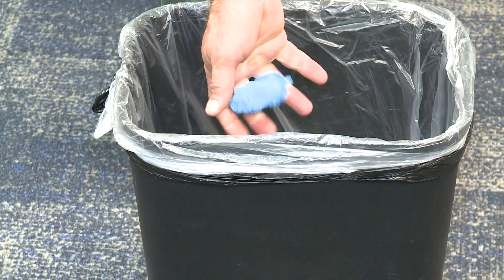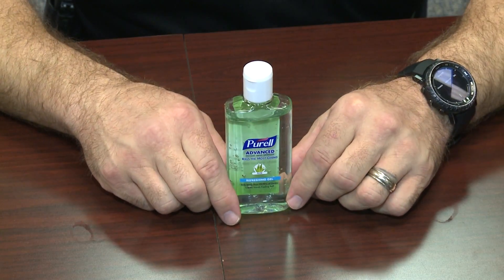Place gloves into the appropriate waste container. Always remember to wash your hands or utilize hand sanitizer.